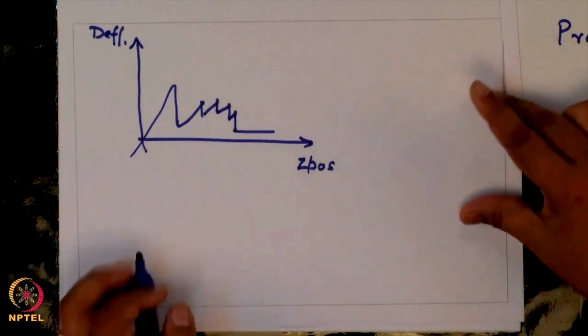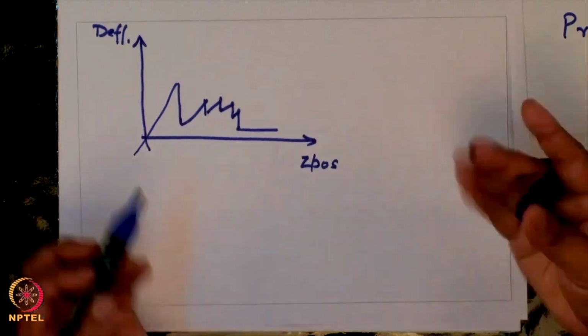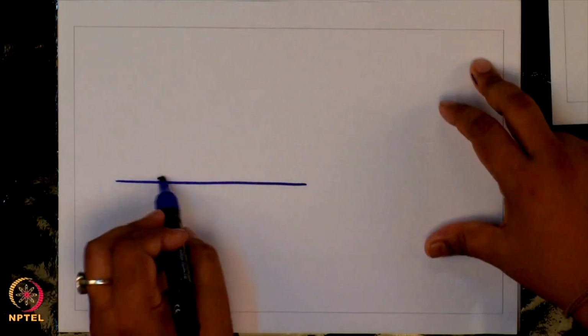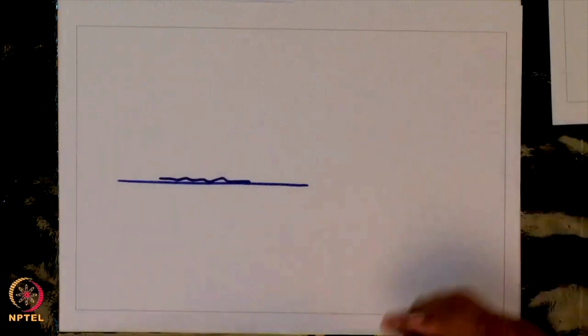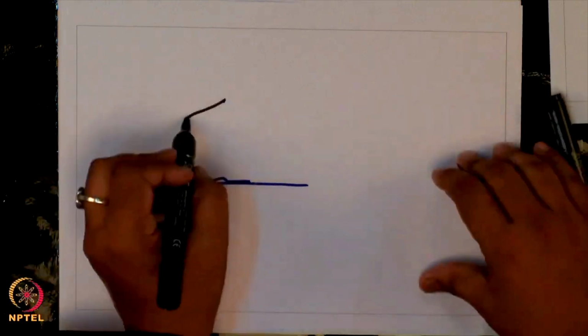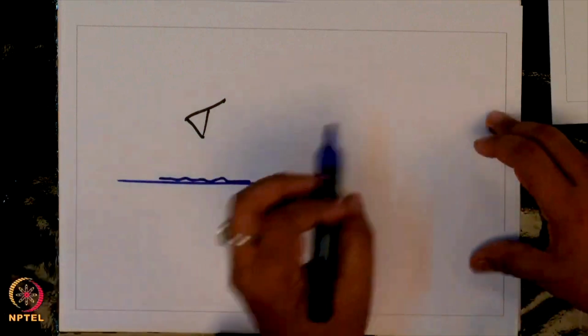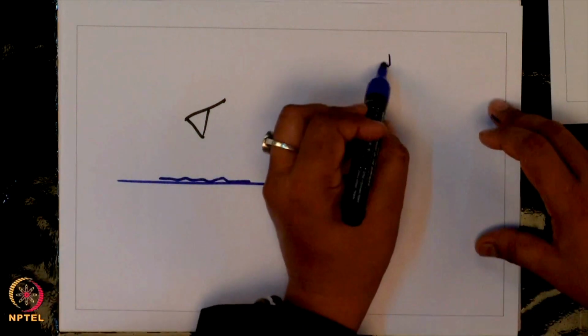Now let us think as to what is happening. Why does it generate this particular structure and why do we say that this is a signature associated with protein folding? So, let me approximate the protein. On the surface there is a protein which is lying down, and this is your tip. If I zoom in, let us assume that the protein has some structure like this.